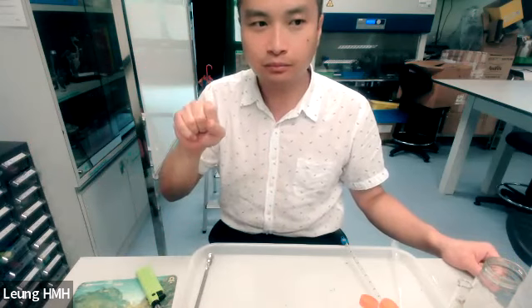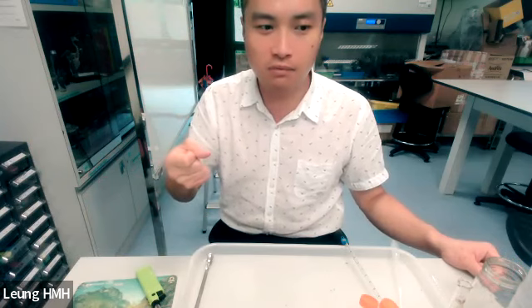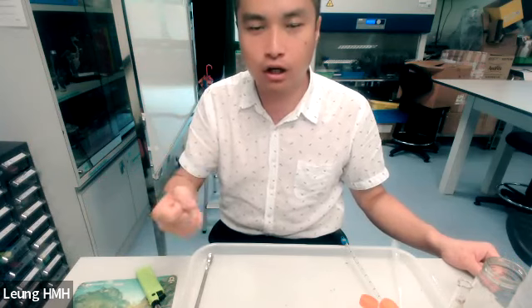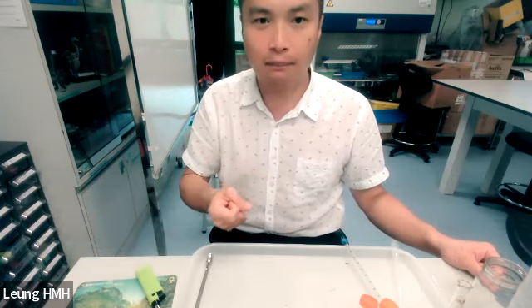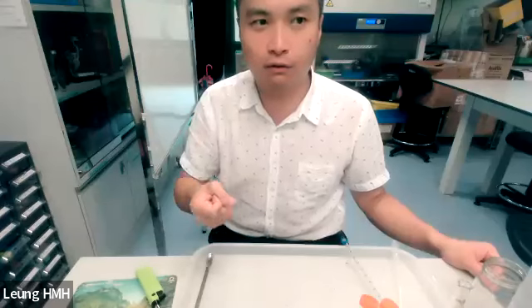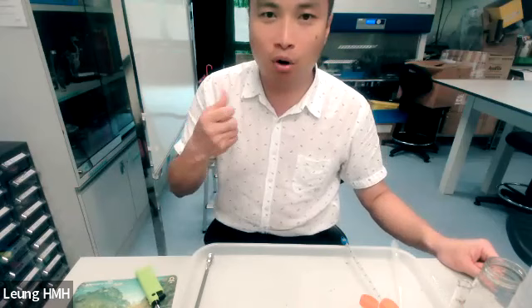And chemically, we use some chemicals to extract the desired product from the mixture, and then we further purify the product.